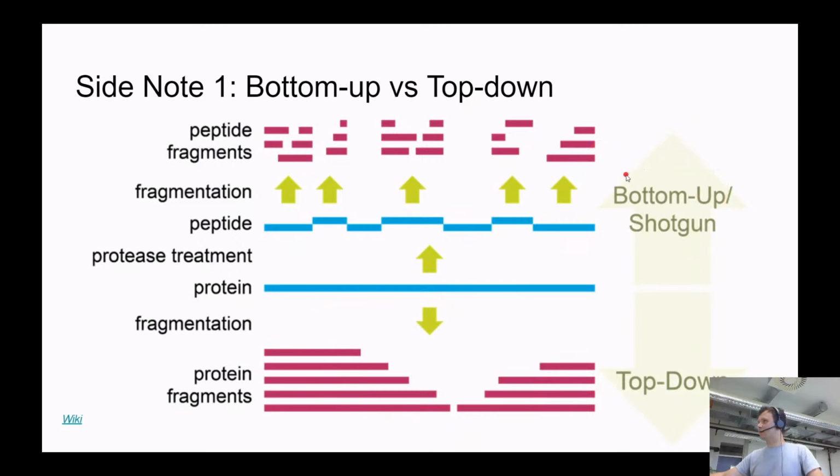But what's the method of choice for exactly the task of analyzing 10,000 proteins? It's the shotgun. And the reason is that it's way easier to deal with peptides. There are less strict requirements for the mass spectrometry instrument for analyzing peptides. Chromatography is also very simple. You don't need such a huge vacuum inside of the instrument. And yeah, that's why shotgun proteomics is very, very popular.